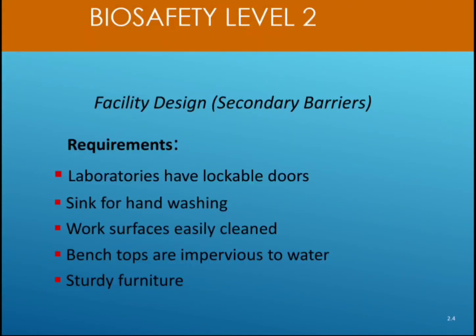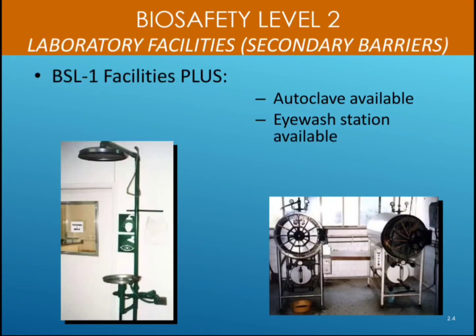In the facility design, secondary barrier requirements are: the laboratory should have lockable doors. Then a sink for hand washing should be there. Work surfaces should be easily cleaned, and bench tops should be impervious to water, meaning they should not allow the absorption of water into the surfaces on which we are working or transferring the cultures. Water should not be absorbed over there, because water activity increases microbial multiplication, and that may also cause contamination in the future.